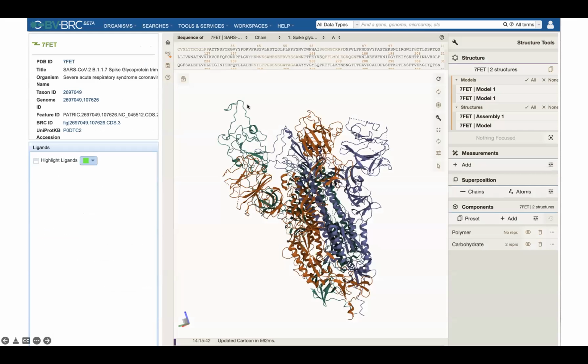So we've started using Molstar, which is a beautiful structure viewer, has great documentation, and generally will give you really nice, crisp images, will let you hide and view specific things, change how you want to look at the structure, and highlight specific areas of your structure. You can use it to measure interactions. So again, I would encourage you to just explore through this because it's really nice.